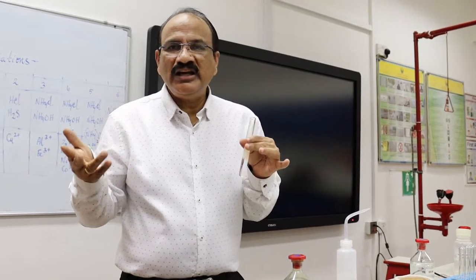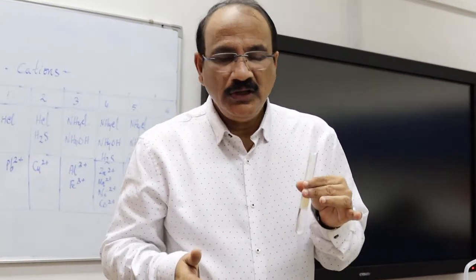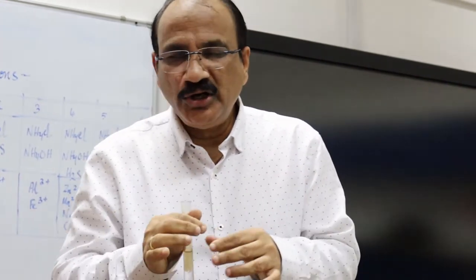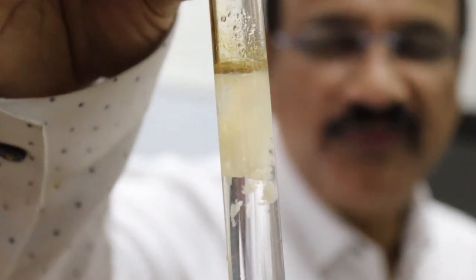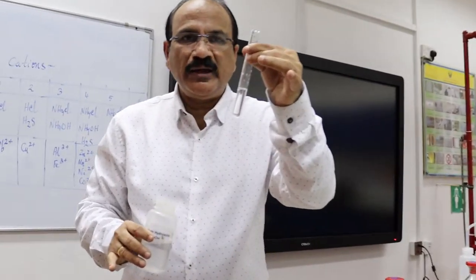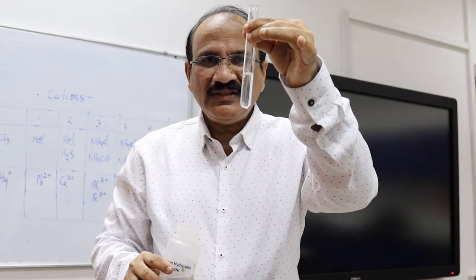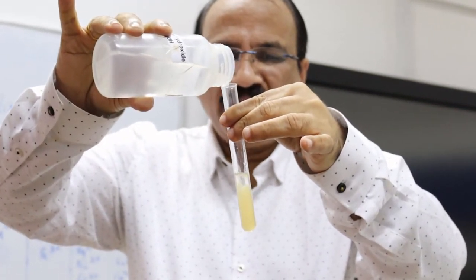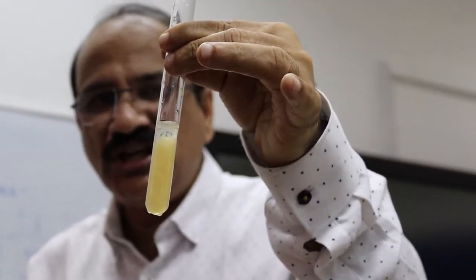Yet another cation in the fourth group is Mn2+. For its identification, we add the group reagents — ammonium chloride, ammonium hydroxide, and hydrogen sulfide — and we obtain a flesh-colored precipitate, which indicates the presence of Mn2+. For the confirmatory test, we add sodium hydroxide in drops and observe the white precipitate gradually changing into light brown.